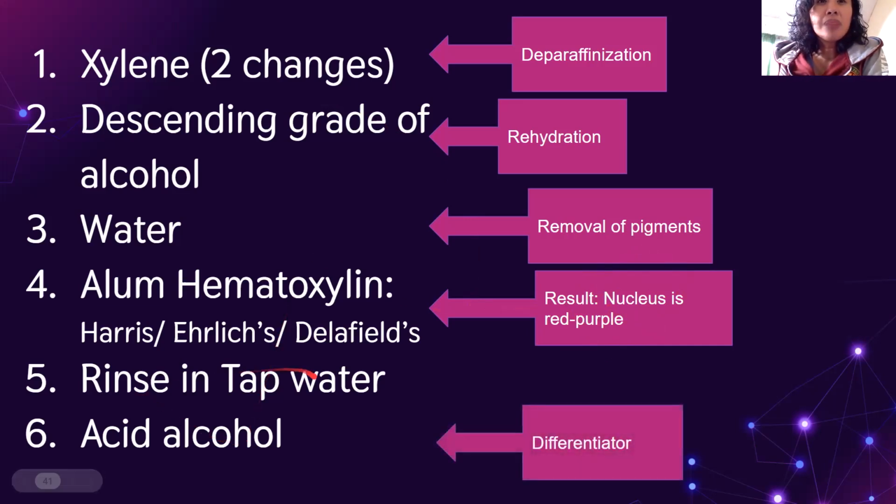So guys, sometimes dito nagkaka-errors eh, when there is inconsistency with how you rinse the tissue, how you agitate the tissue, pag manual staining. Discrepancy sa stain when it comes to rinsing. So dapat maging standardized to. And next is acid alcohol. Acid alcohol is a decolorizer or a differentiator. It removes the excess hematoxylin, so if there was overstaining, it will remove the excess.